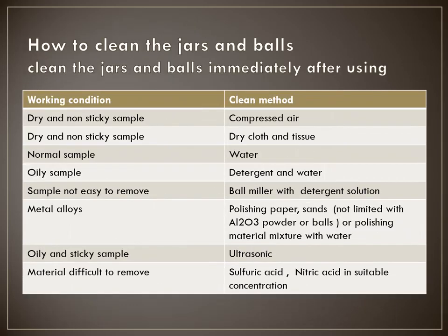And now you need to consider how to clean. You can refer to this table for the cleaning methods for different materials.